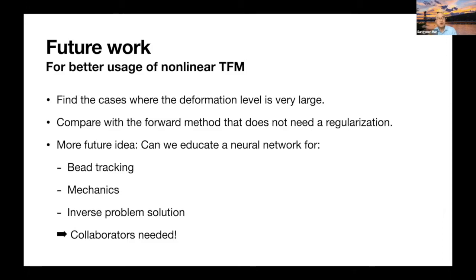And also we want to compare the forward method that does not need the regularization. Currently we are using this regularization: we build the forward method and do the inverse problem solution. But there is a way to directly apply this mechanics from the displacement to the strain, to stress, and to traction. So those reconstructions can also be done, and we want to compare with those direct methods. This is a future idea.